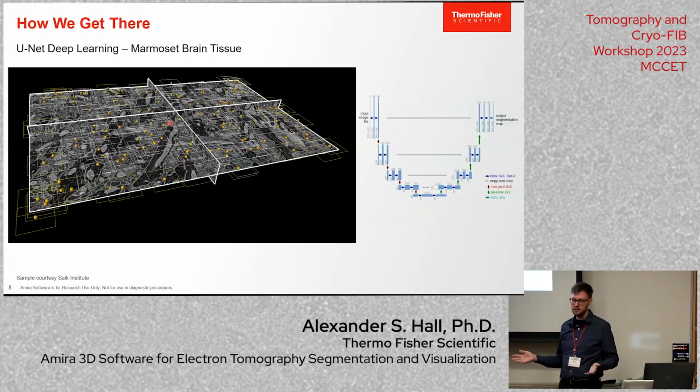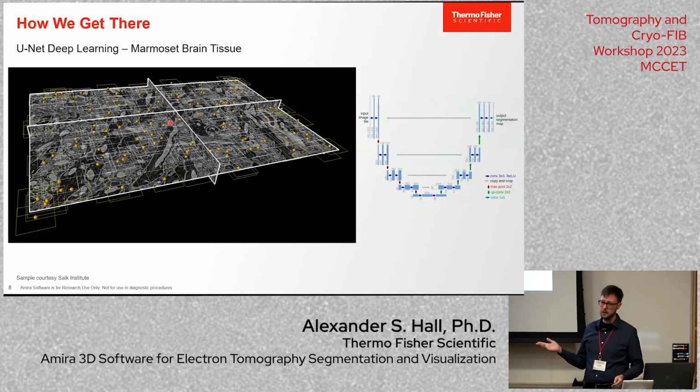It's not a very complex model. Deep learning has many, many more layers, usually upwards of 10. The more sophisticated ones that are in the news right now have hundreds of layers. So UNet is so called because it has a characteristic U network when it's abstracted this way.